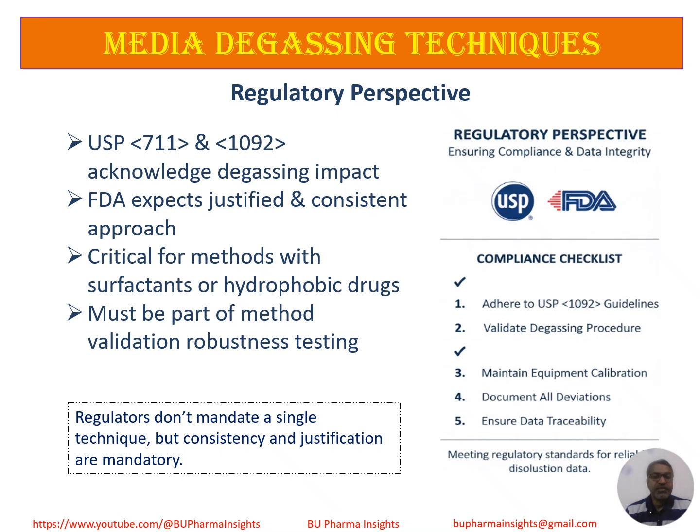Both USP 711 and 1092 acknowledge the impact of dissolved gases on dissolution testing, and the FDA expects a justified, consistent approach. Degassing control is especially critical for media containing surfactants, hydrophobic drugs, and methods requiring high reproducibility. That's why degassing must be included in robustness testing during method validation.